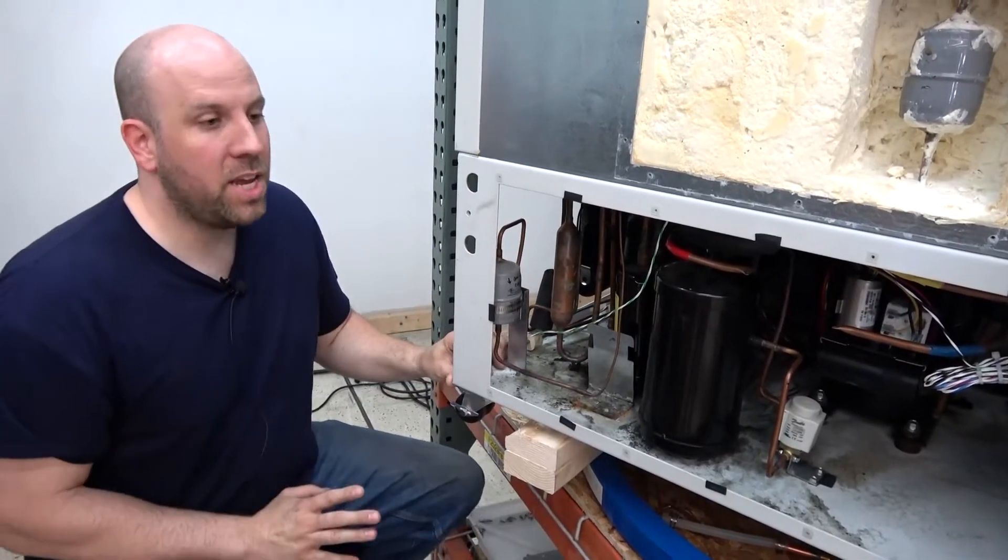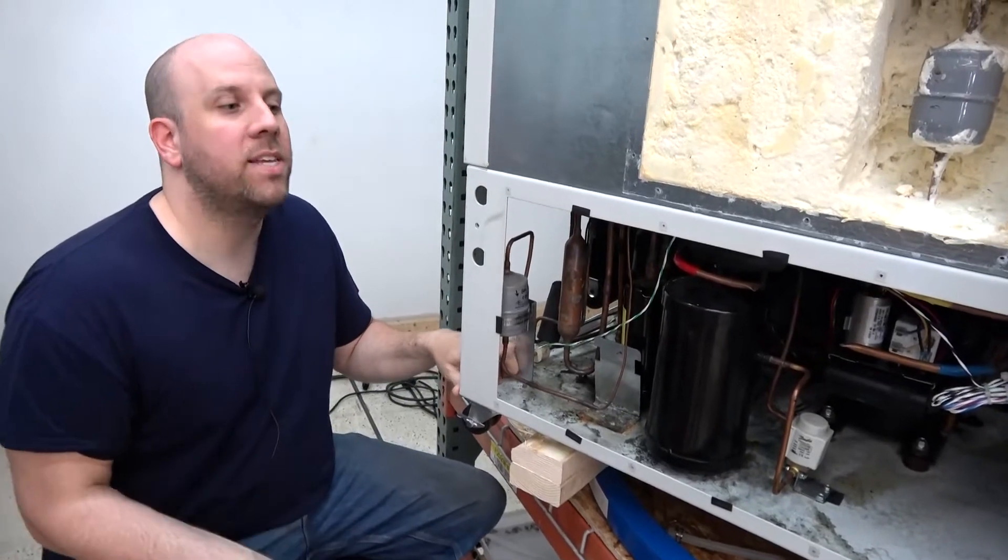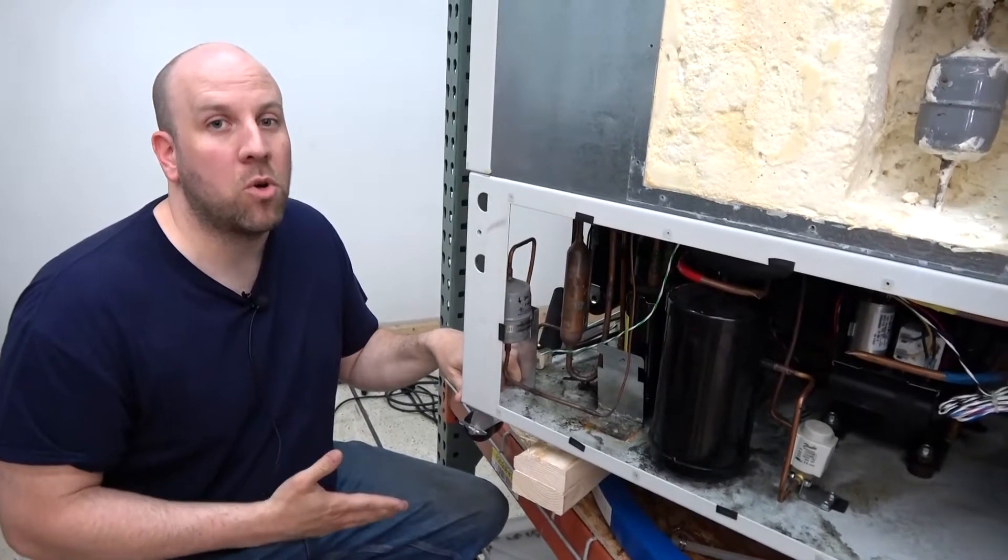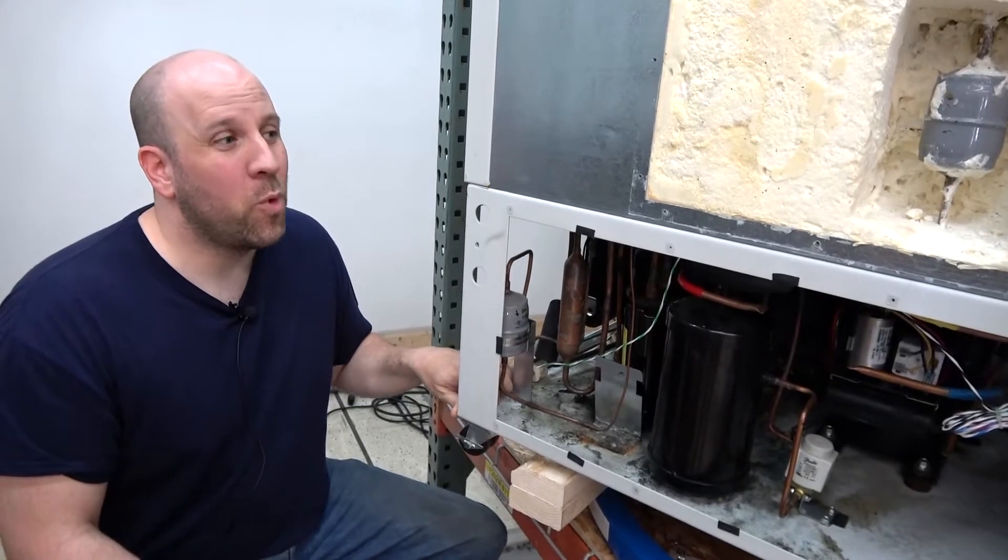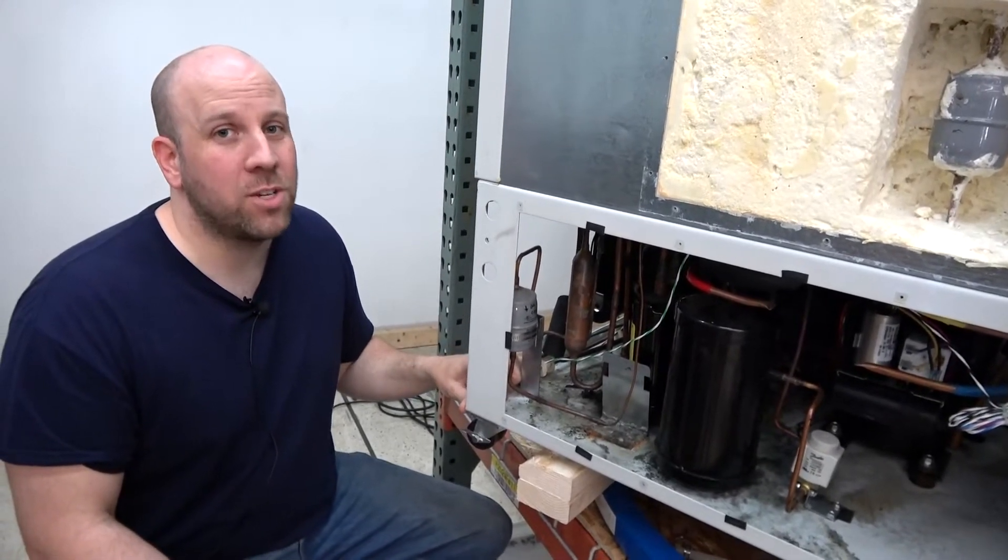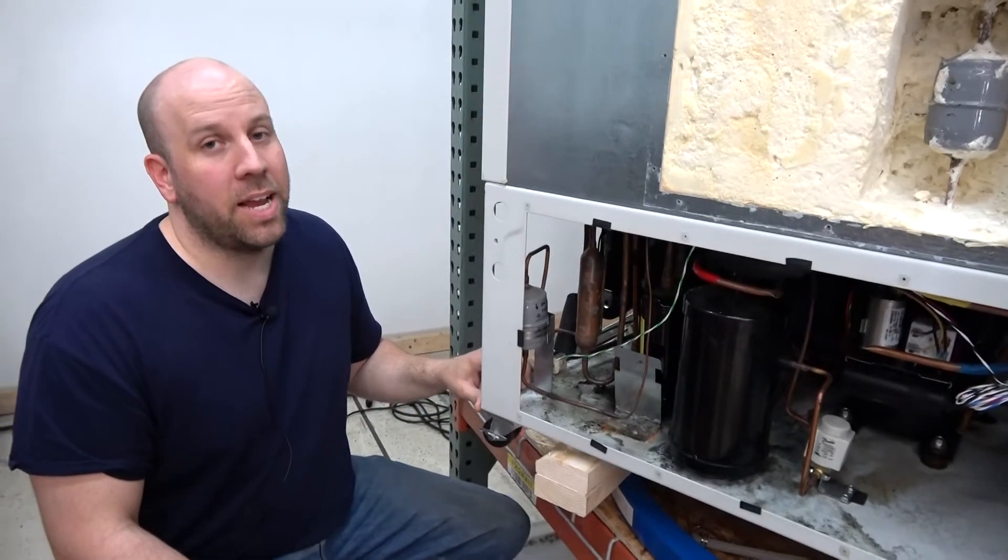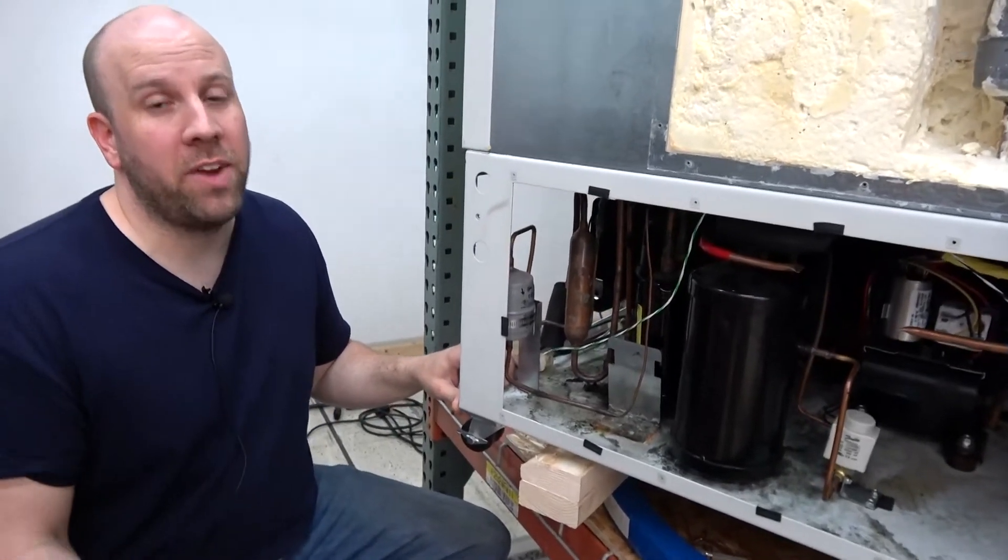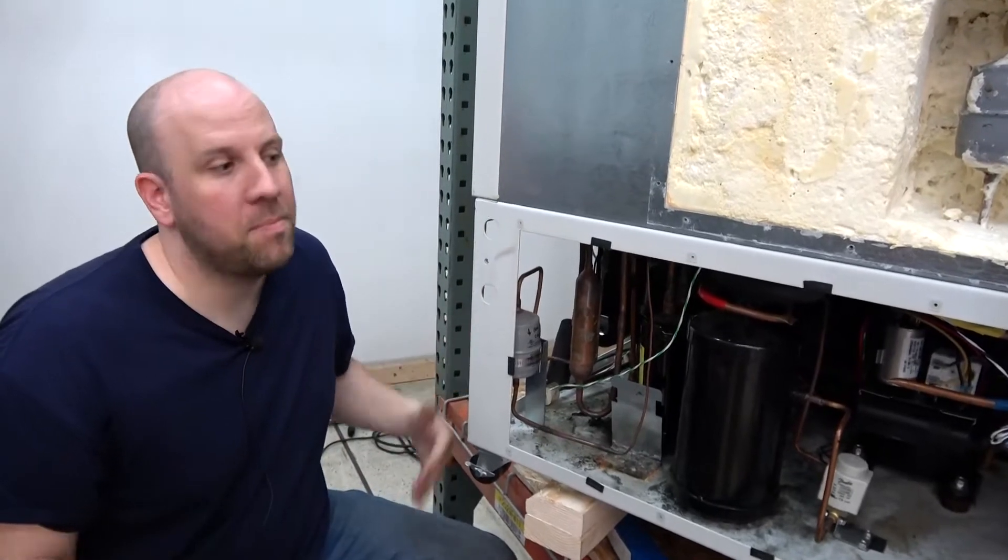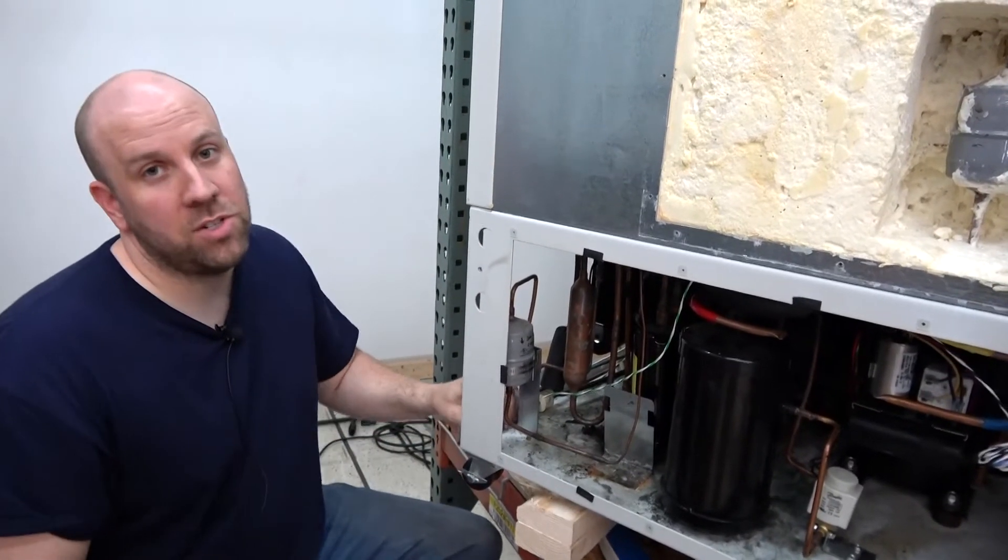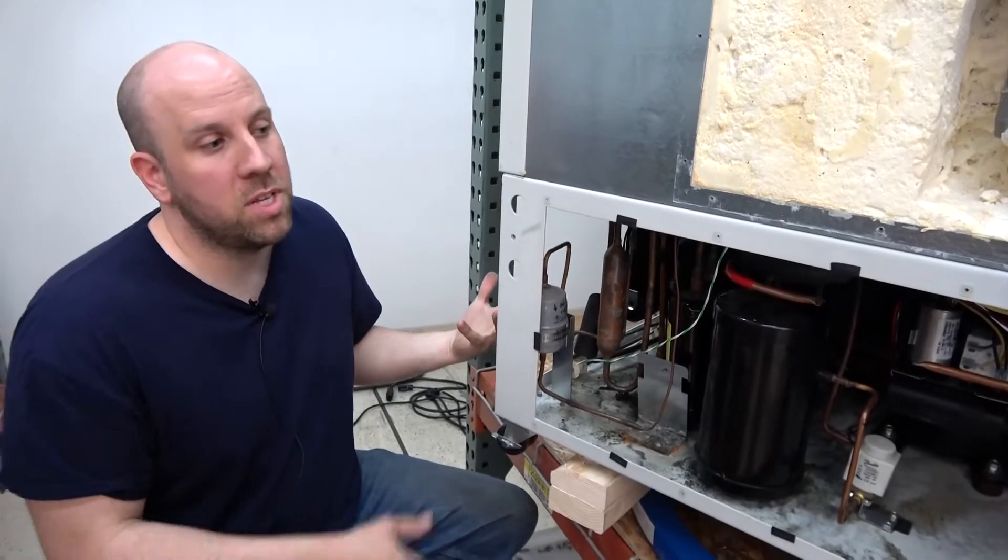So the second stage we test the same way, except we run the whole thing and see how cold it gets. If it doesn't reach really close to manufacturers design temperatures, like we shoot for negative 86 because it's a negative 86 degree freezer, if it doesn't do that, generally we do the flush. That's how we refurbish these.